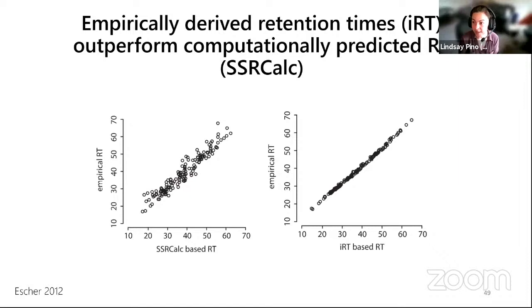Can I use a Spectronaut library in Skyline? Skyline's library building takes a whole mess of different inputs. So I will find a link, or maybe one of the TAs can back me up and get you a link to the BiblioSpec blib builder list of software that it will take for spectral libraries.